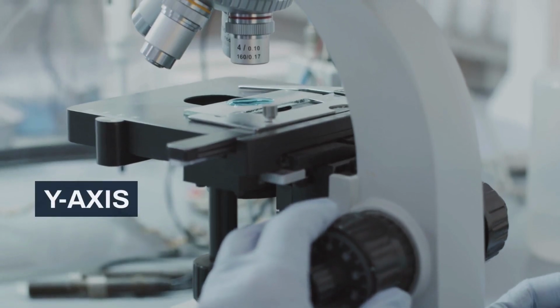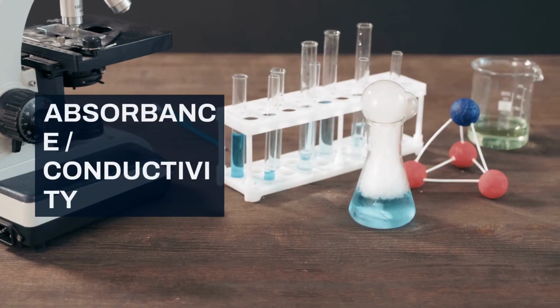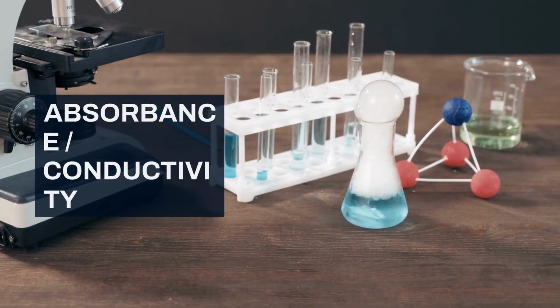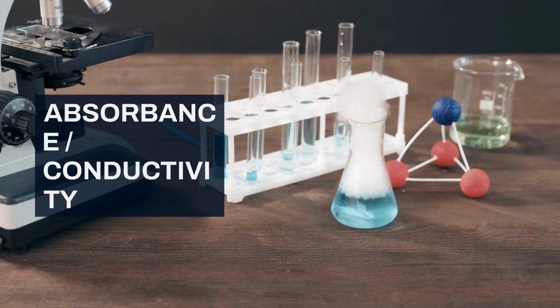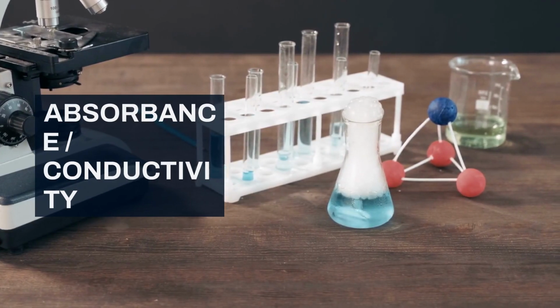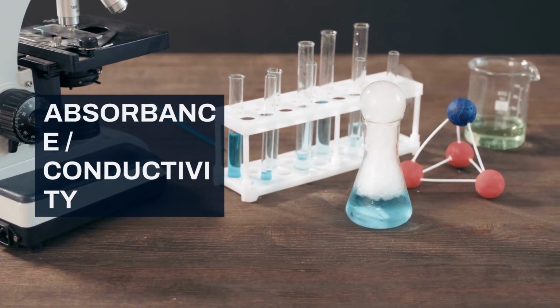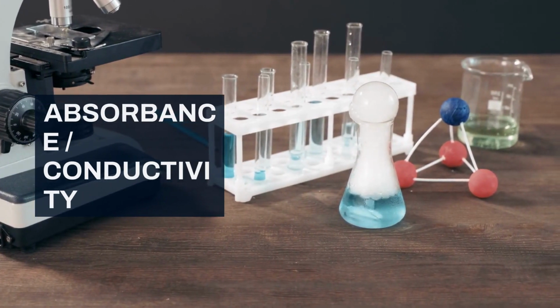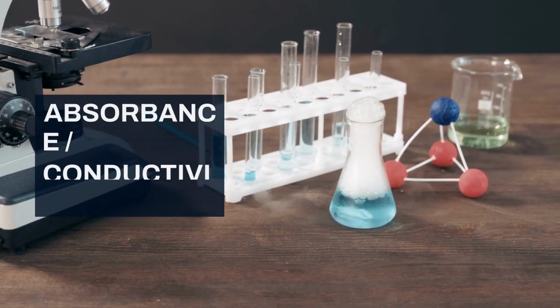Next, consider the y-axis. This axis measures the detector signal. Often, this is absorbance, which tells you how much light a substance is blocking, indicating its presence and quantity. It could also be conductivity, especially if you are monitoring salt concentration. So, the y-axis tells you how much of something is eluting at any given time.